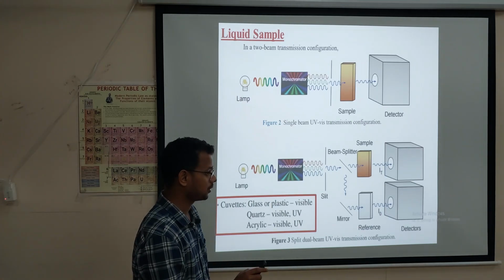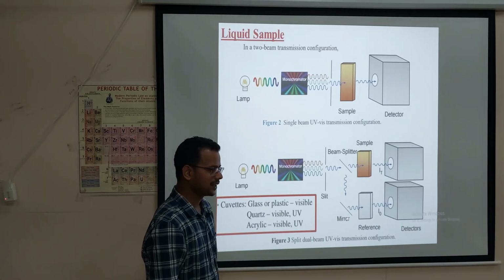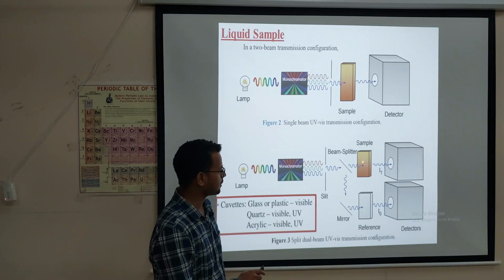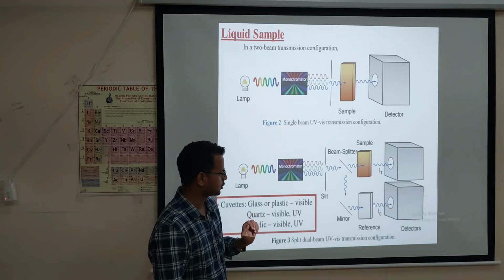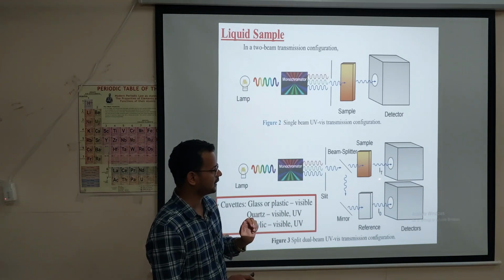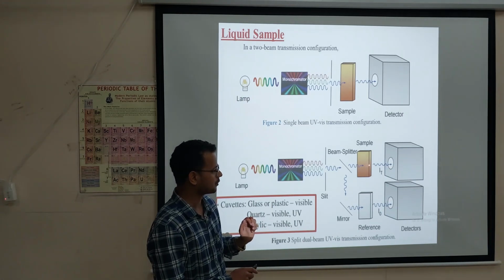Only for liquid sample. It is quantitative measurement, right? And this is a reference. A reference means only solvent. And this is a sample, solute present in the solvent, right? So this is I0, because I will get 100% light here, and here IT, transmitted light, I will get here, because some light will be absorbed here. So after absorbance, transmitted light I will get here.